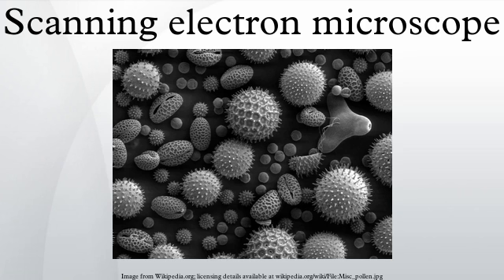The energy exchange between the electron beam and the sample results in the reflection of high-energy electrons by elastic scattering, emission of secondary electrons by inelastic scattering, and the emission of electromagnetic radiation, each of which can be detected by specialized detectors. The beam current absorbed by the specimen can also be detected and used to create images of the distribution of specimen current.